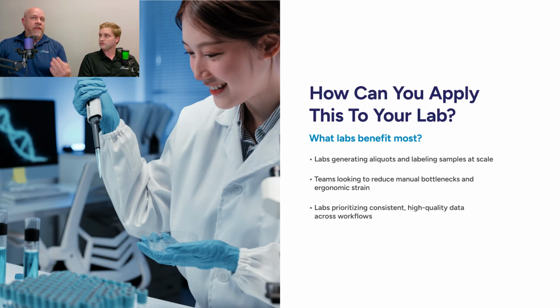But scale also works in the other way. When you are preparing your samples manually, it's that necessary evil. So you want to do everything all in the same day. We're going to have one really bad day. And so you might be preparing for multiple different tests or multiple different runs within that same day. If you have automation, you can have just in time delivery of whatever those samples are. You don't have to do all 15,000 at the same time. Maybe your study is 200 samples, or maybe it's 500 samples. You can just prepare those 500 by pressing go, and it doesn't leave all of that bottleneck in that entire day.